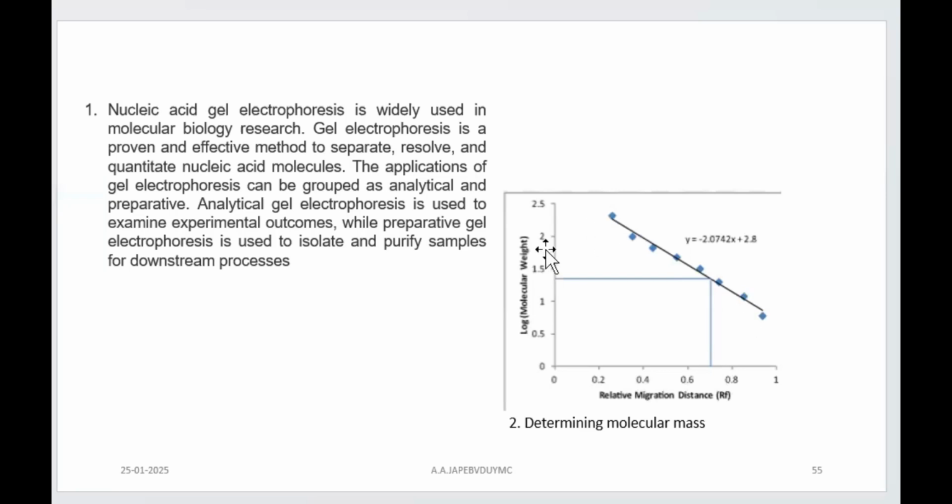Or here in this case it is 2 into 10 raised to 4. So when I say 2 into 10 raised to 4, and this size, it is comparable to say 0.7 into 10 raised to 4. That is how if I go. Now, the higher the protein mass, the higher the molecular size, the higher the molecular weight, it is going to migrate slowly, and the mobilities will be less, right?